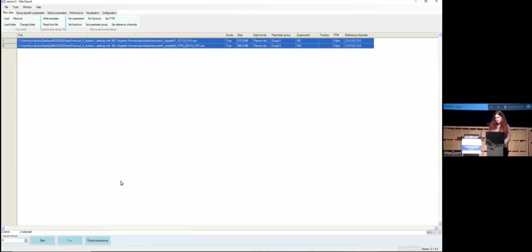This, as I said, is 3 different MaxQuant processes, so it will give you 3 different TXT outputs, okay? Today, during this tutorial, because we don't have enough time, I'll provide to you and we will use one of the outputs. That is exactly this one, when we take as reference channel the samples. So not the reference channel as stated, but the opposite. And so what we do is this one, we can close it.